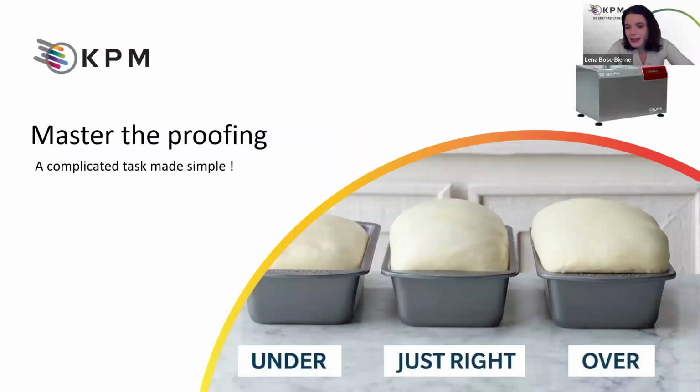And then you have the proofing. Proofing, again, may be seen as a little bit tricky because it's both chemical, it's rheological, it's many things at the same time, and it will impact everything. So the idea here is, again, to put a little bit more objectivity into that.